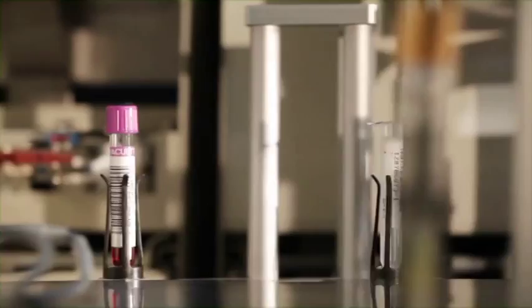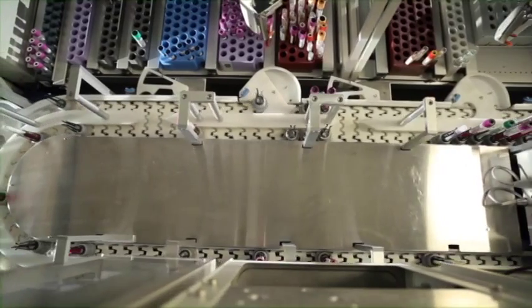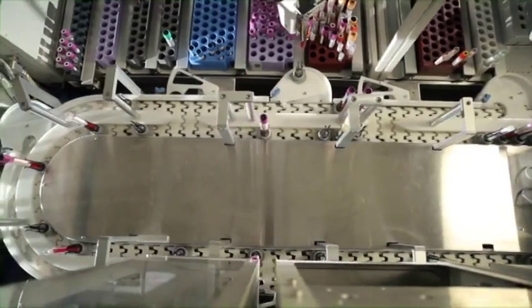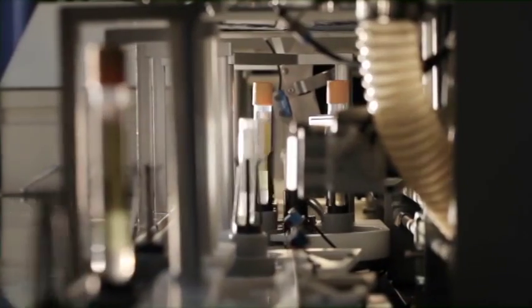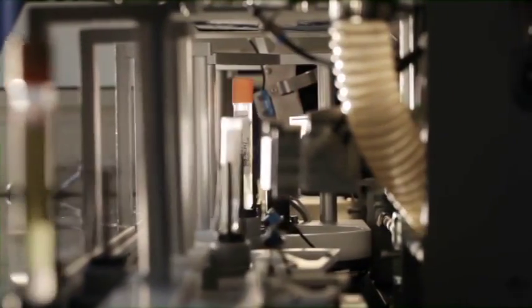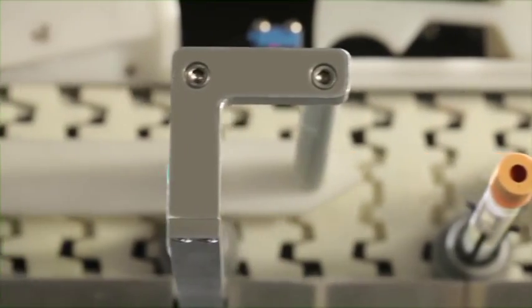While on the system, samples are transported from module to module in pucks that move around the conveyor track.